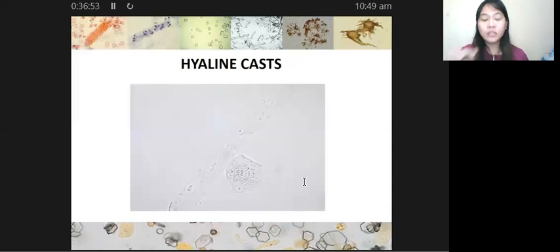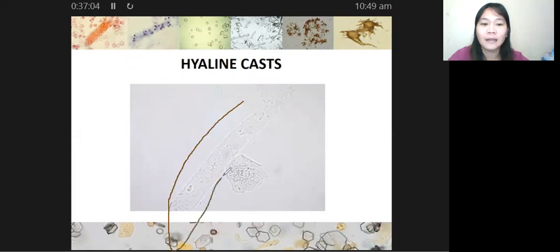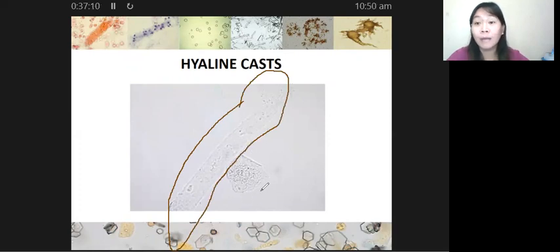Ito muna. So as you can see, may nakikita ba kayo? Okay, so mahirap po talaga siyang hanapin. But in this particular slide, so yan yung ating hyaline casts. Okay, so meron siyang katabi na squamous epithelial cell. Okay, so your hyaline casts, they are usually colorless with a homogeneous protein matrix. And as you can see, the ends are rounded.